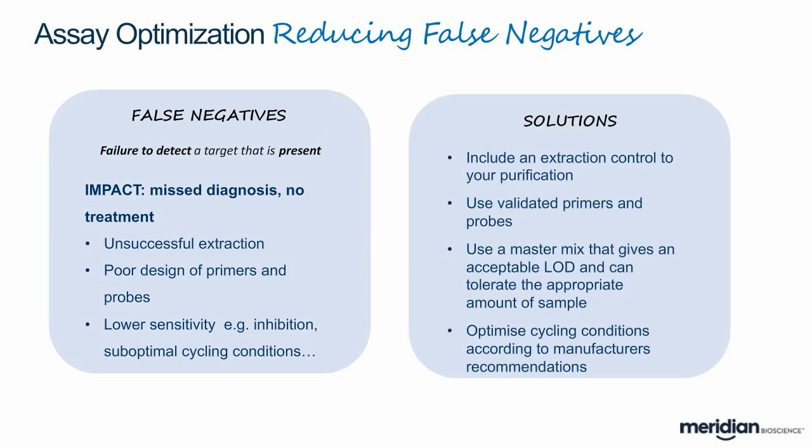In order to address this, we would recommend to use an extraction control to rule out problems with your purification, use validated primer and probes if they are available, and follow the guidance we provided for improving sensitivity in the previous slide.